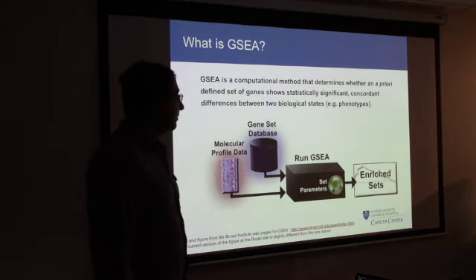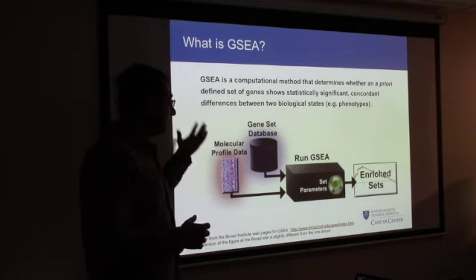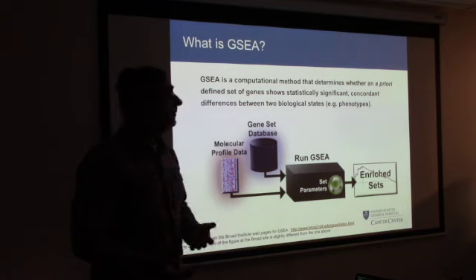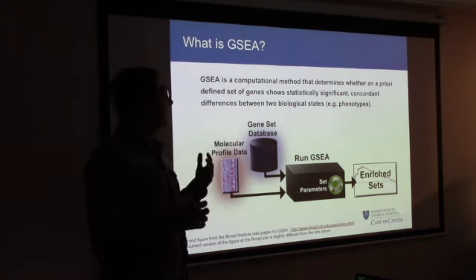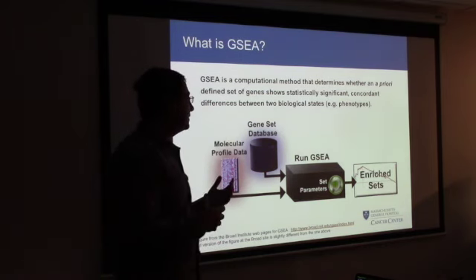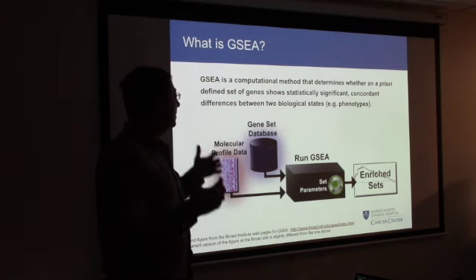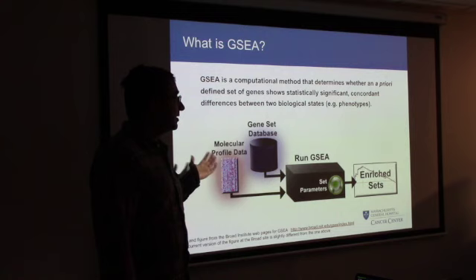So this, again, is from the Broad's website. You can think of GSEA as a computational method or an algorithm that determines whether an a priori defined set of genes shows statistically significant, concordant differences between two biological states.